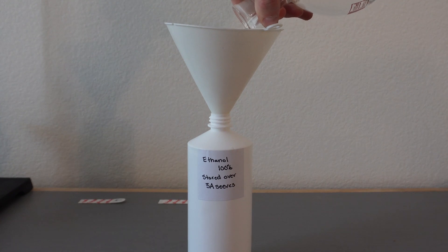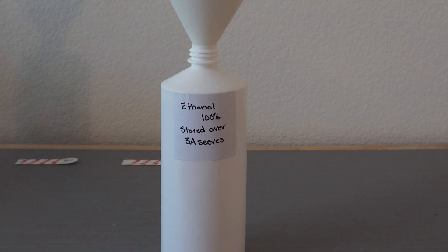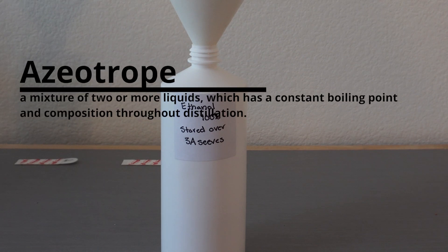The main issue with this is that the ethanol in water creates an azeotrope. This means that together they have a higher or lower boiling point than each of the individual chemicals.